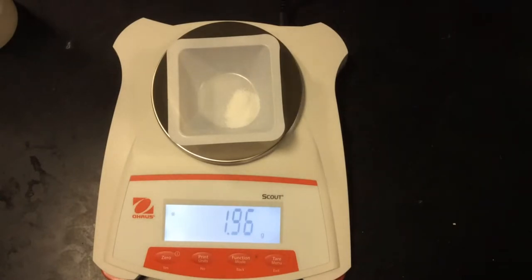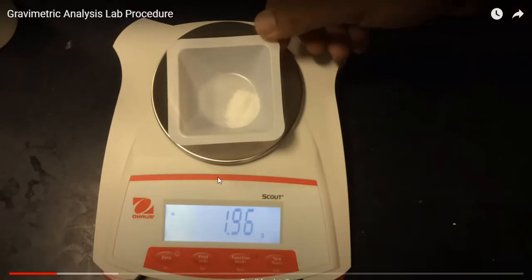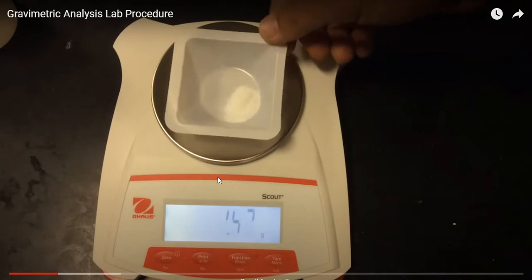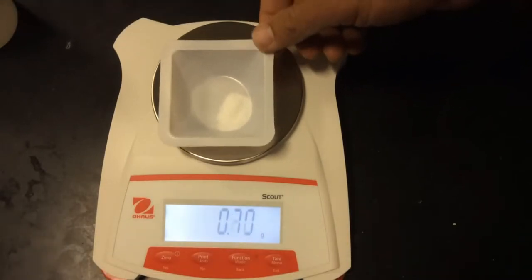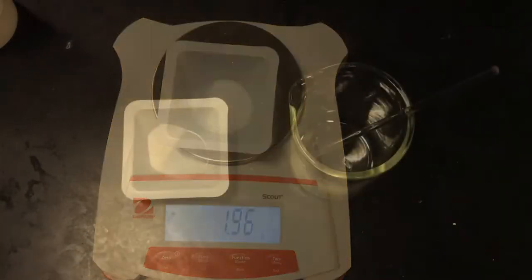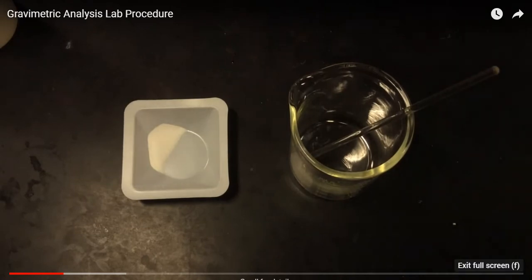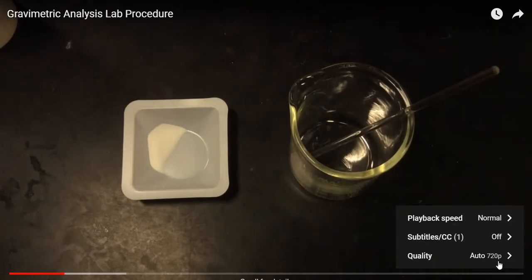So now we're going to pre-dissolve this so that all of the sodium or potassium ions dissociate from the carbonate ion. Again, the carbonate ion is our friend here. So our next step is to dissolve our group 1 metal carbonate, and make sure that we get all of our ions completely dissociated.